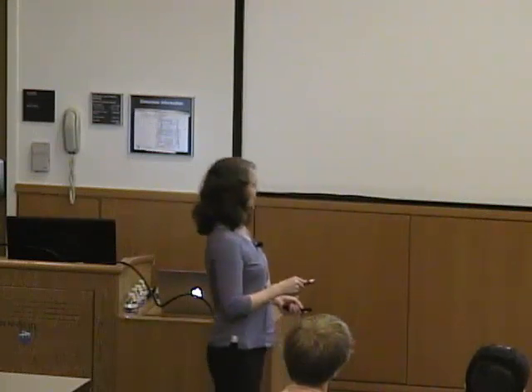And then in addition to that, you can do all of the things that you do with NMR anyway, which is already a powerful technique: determining structure, looking at exchange phenomena, looking at dynamics, etc. Although sometimes your ability to do some of these things is hampered by the effects of the unpaired electrons. Now in cases where you have narrow lines, like the cytochrome, that's the low spin iron 3, you can do all of this. In things like the azurin and the copper 2 with the really broad lines, you start to lose your ability to do a lot of these things.